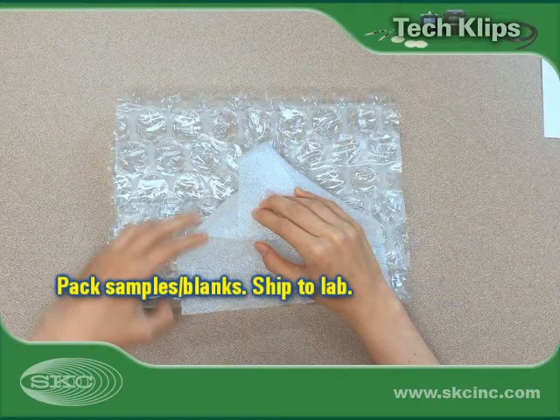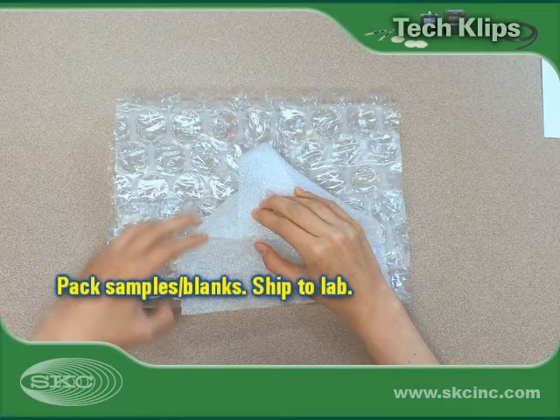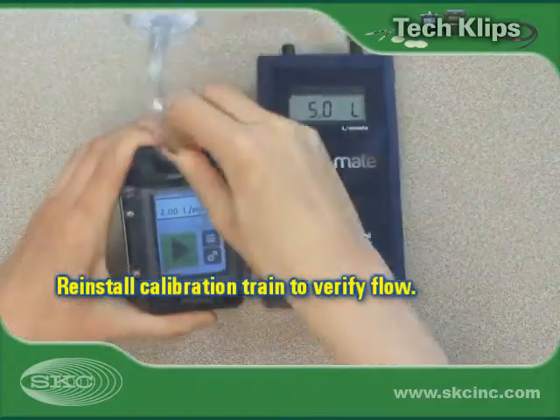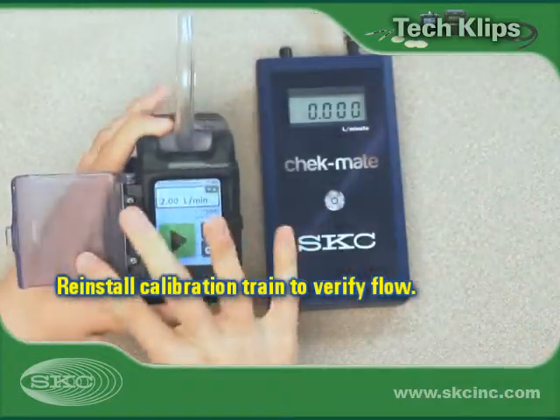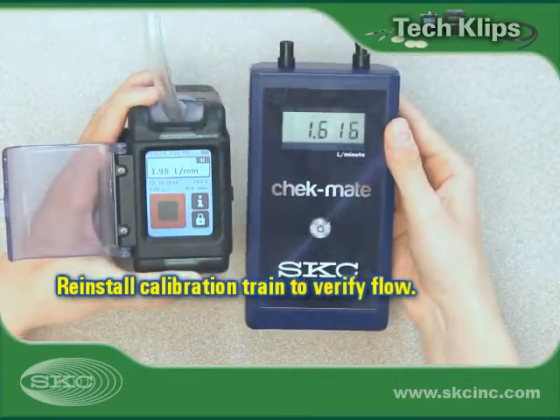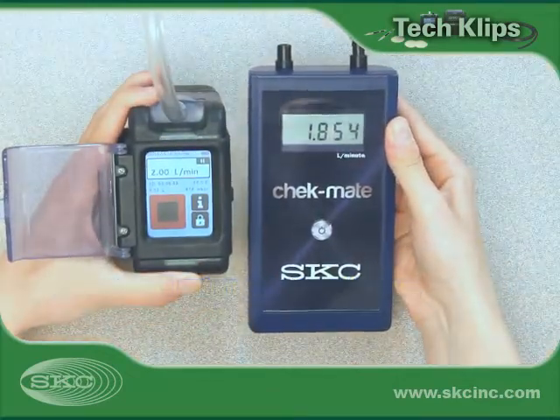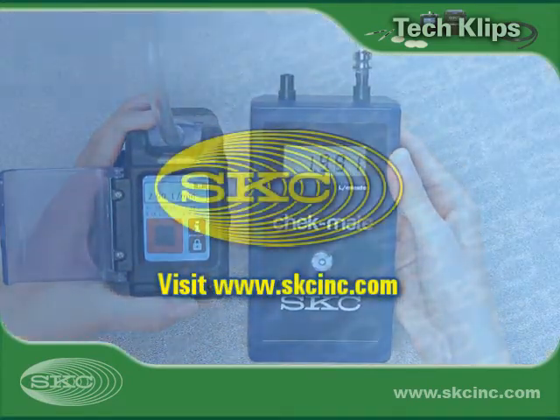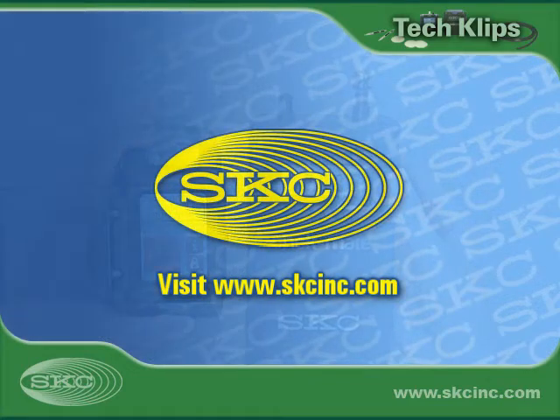Package all samples and blanks for shipment to an accredited laboratory for analysis. Remove the cassette holder from the pump and reinstall the calibration train to verify that flow calibration is still within 5% of the desired flow rate. For more information and tech clip videos, visit www.skcinc.com and click on Technical Library.